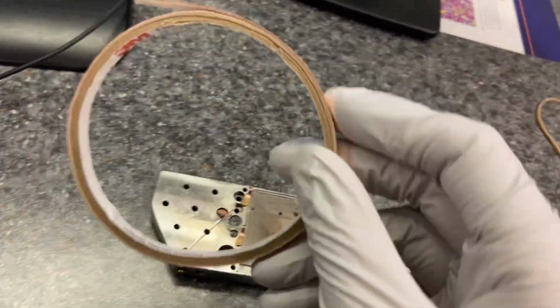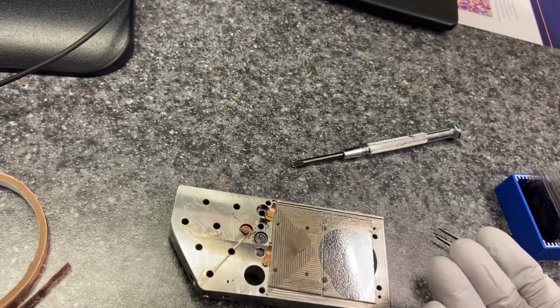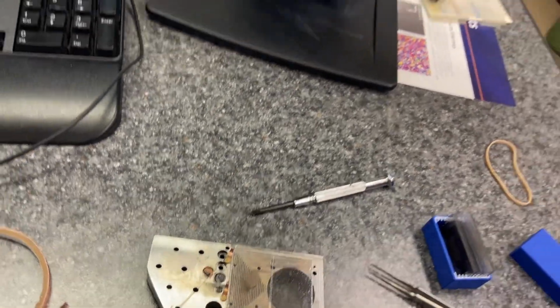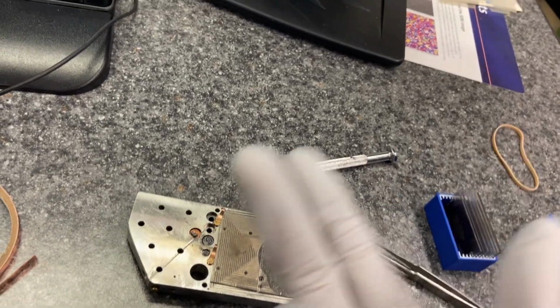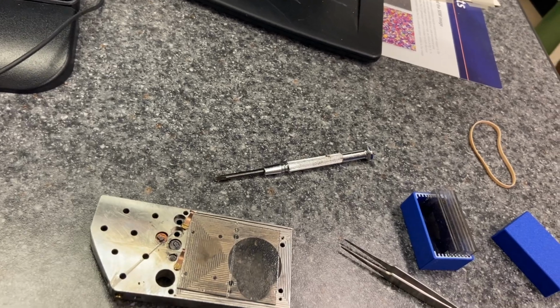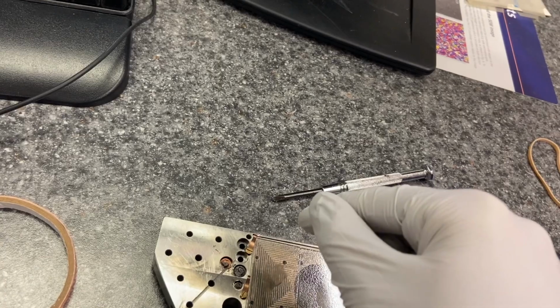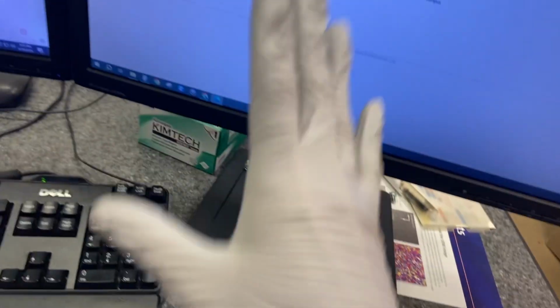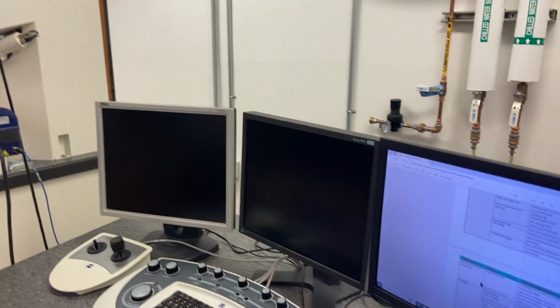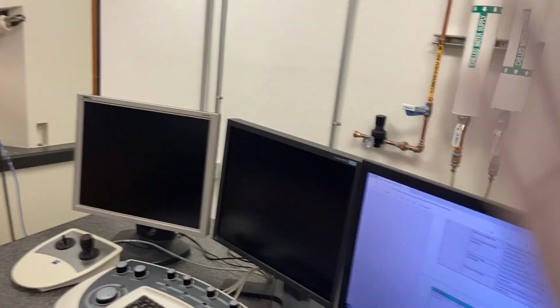You're putting a conductive metal essentially on top, so electrons are going to be able to flow freely. But also, when I do any sort of quantitative analysis, you want to calibrate your beam through what's called a beam measurement. We can do this using the copper tape. We can have the beam over the copper, essentially do the standardization or calibration of the beam measurement. And then once we do that, we can normalize it to what the conditions are right now in the SEM, because it varies. The beam that we're measuring isn't necessarily the same every time when you use the SEM.